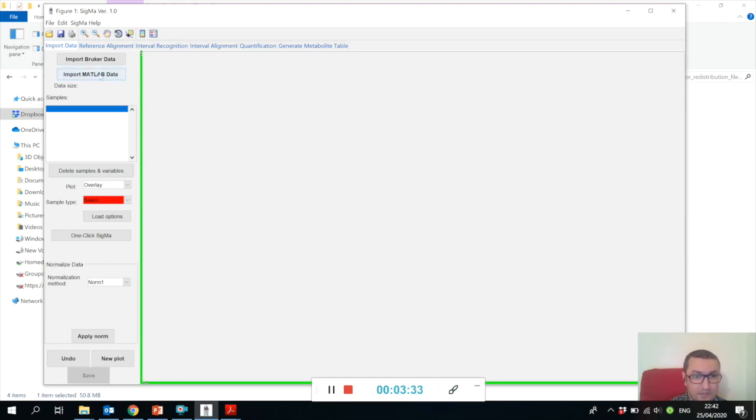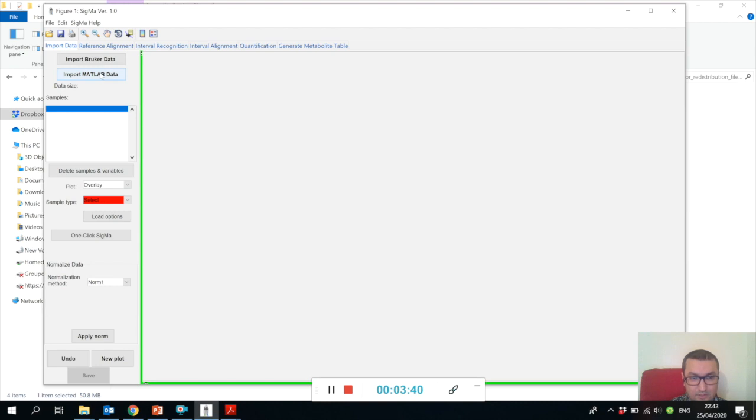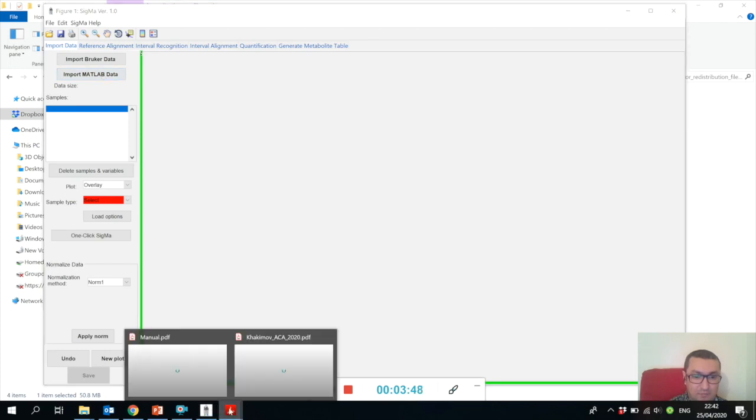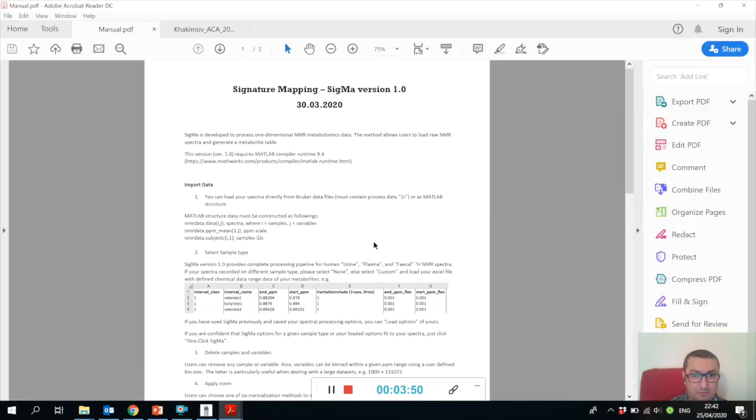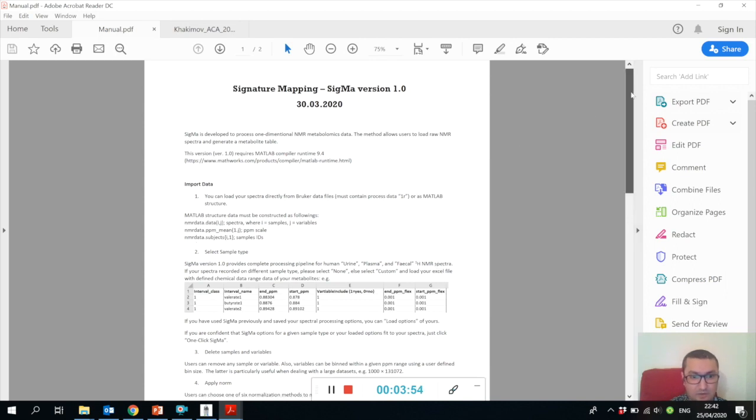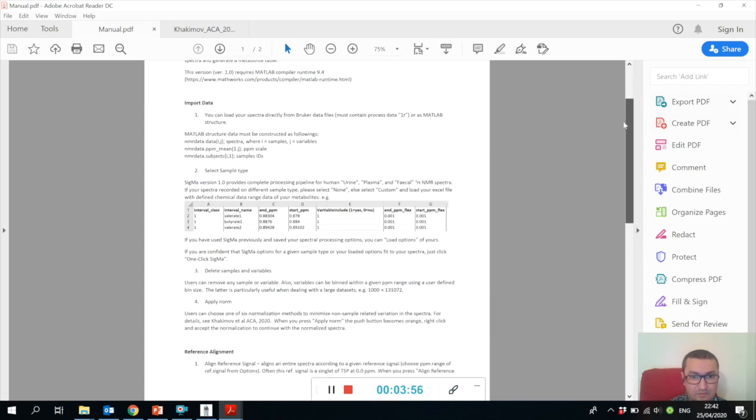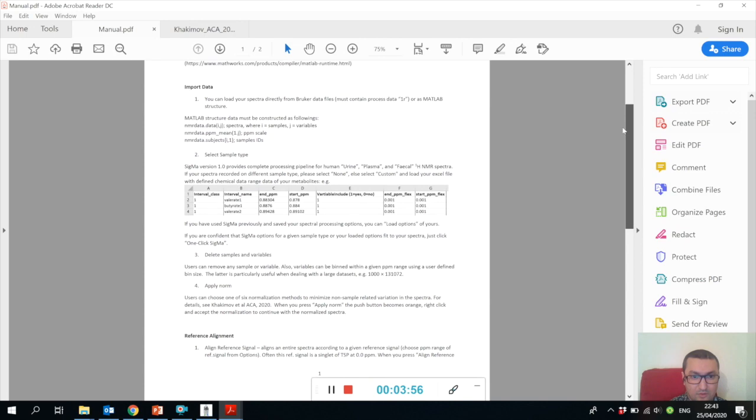You can upload your NMR spectra, which should be proton NMR spectra, one-dimensional. You can either upload the raw Bruker data files or MATLAB data files. If you want to upload MATLAB data files, please look at the manual for how your MATLAB data files should be organized.